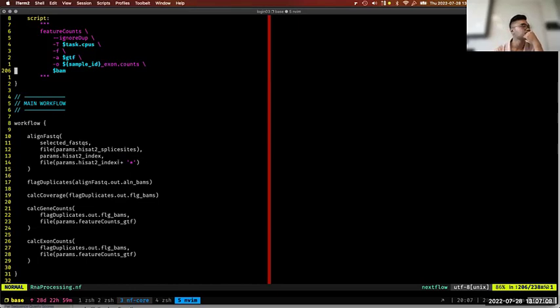With the splice sites, it's just a single file. Correct. Yeah, so once you have globbing, it'll intelligently grab all those files. Like I was saying, if you have a directory full of fastqs, I don't think you would use this command, but you could do something similar to turn all of those into file objects and then dump them in a channel. Yeah.